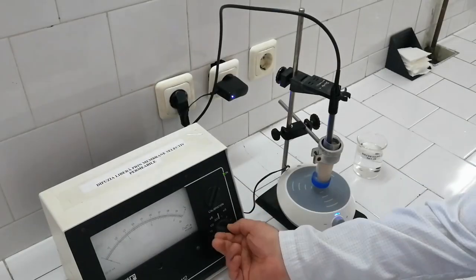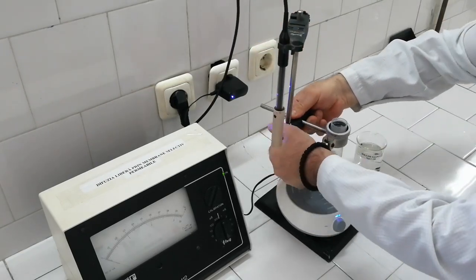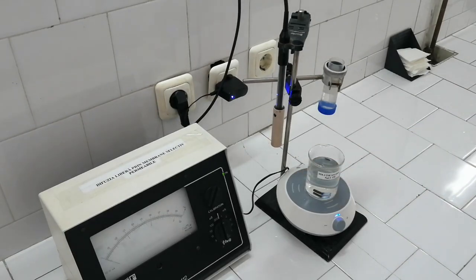Set the 1000 millisiemens measuring range and lift the electrode in air. Remove the container equipped with the membrane and place on the magnetic stirrer the beaker containing the saline solution. In the second part of the experiment, you will put the two solutions in contact through the selectively permeable membrane. Using conductometry, you will observe the diffusion of ions from the saline solution through the membrane into the distilled water filled container. In order to determine membrane's permeability, you will measure the time evolution of the electrical conductance of the solution in the container equipped with the membrane.